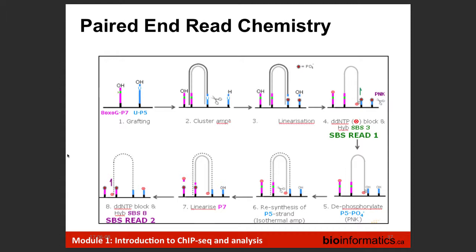So that's how it deals with it. But if you have paired end reads, you can actually anchor it by its paired end, which is somewhere else flanking that retroviral element. And now we know that this is a uniquely mapped read. So we know that because this uniquely mapped read is in this place in the genome, the retroviral element is actually this one, because it couldn't possibly be one on a different chromosome or kilobases away. So that is some ways of using the paired end data.